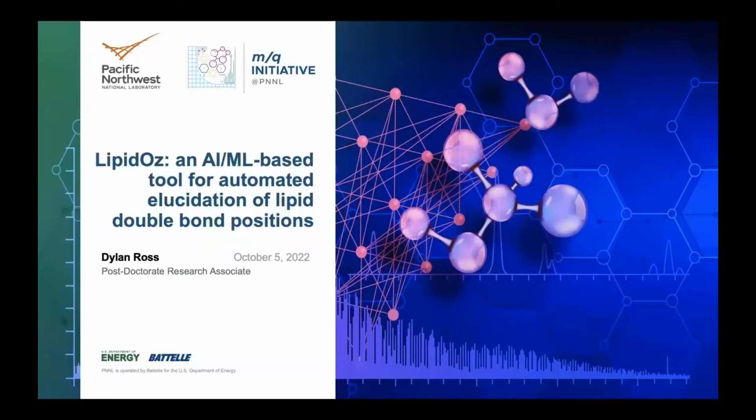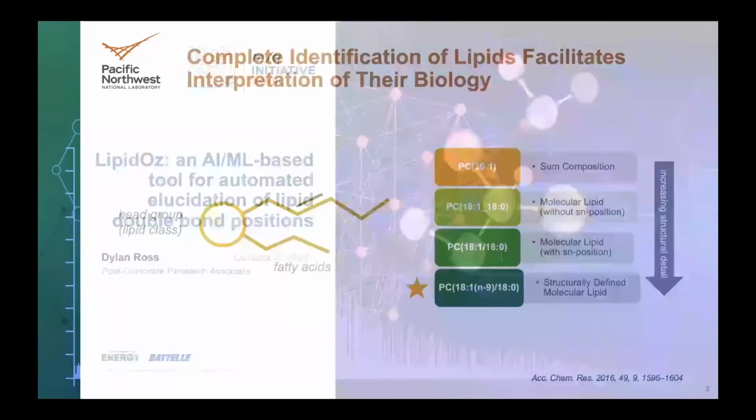So I'm Dylan. I'm a postdoc here at PNNL, and today I'll quickly go over a tool we've been working on for the automated elucidation of double bond positions from OzID data. We call it LipidOz.